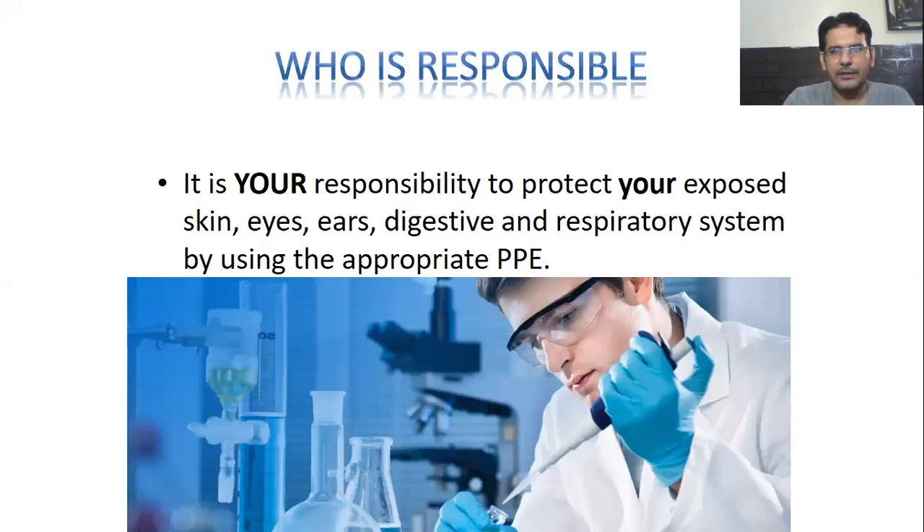So we are going to start. The first thing is our responsibility. It's your responsibility to protect your exposed skin, eyes, ears, and digestive and respiratory system by using the appropriate PPE. We have to decide what PPEs are important for ourselves. In most developed countries — I have done experimentation in the United States, Japan, and a few other countries — before starting experimentation, it's important that you go through a course about biosafety and about personal protective equipment.